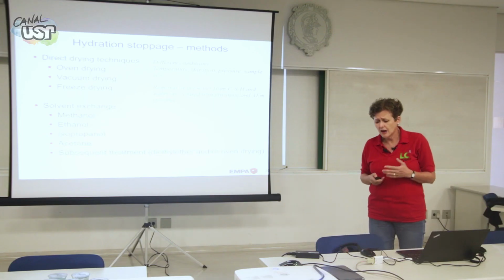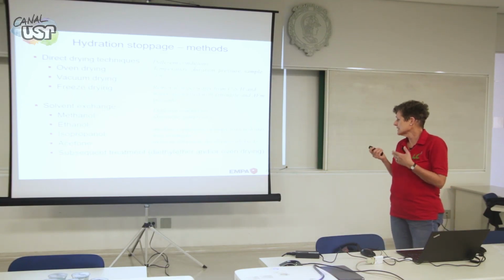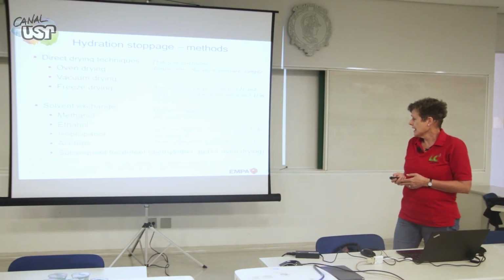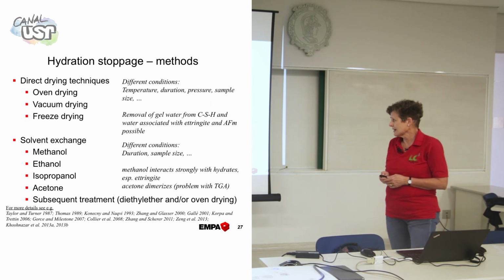These are both very good techniques for removing water. And of course, there are still some issues about how long you do it, and methanol particularly interacts strongly with the hydrates, which is another reason for not using it. And there's a lot of detail in the literature, which is given in the references in the chapter.